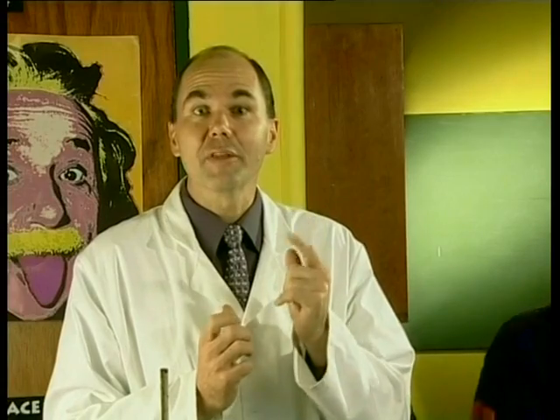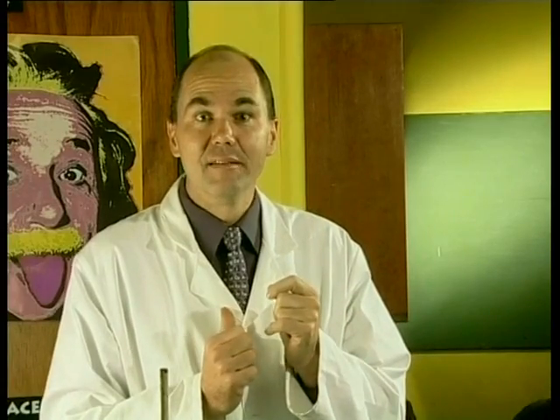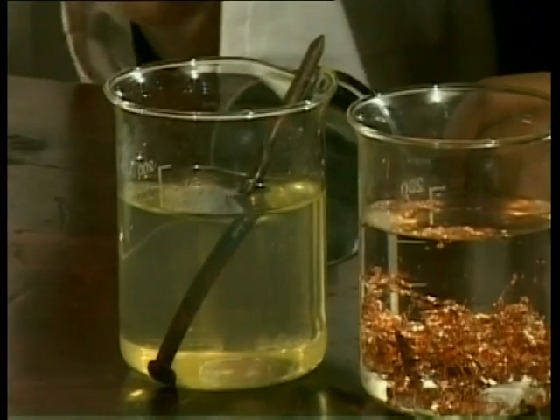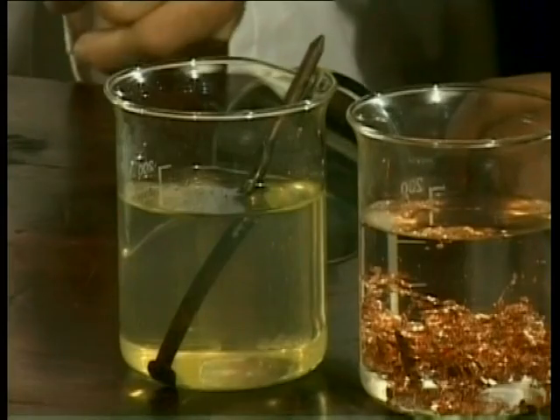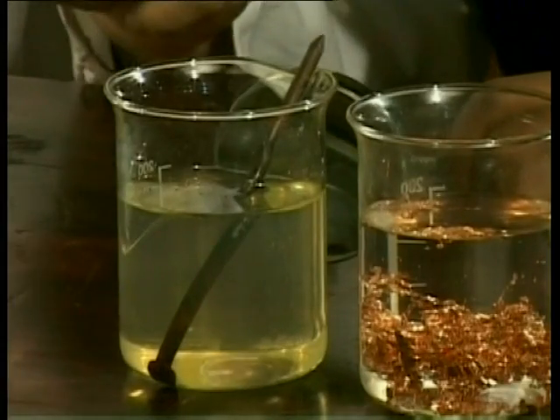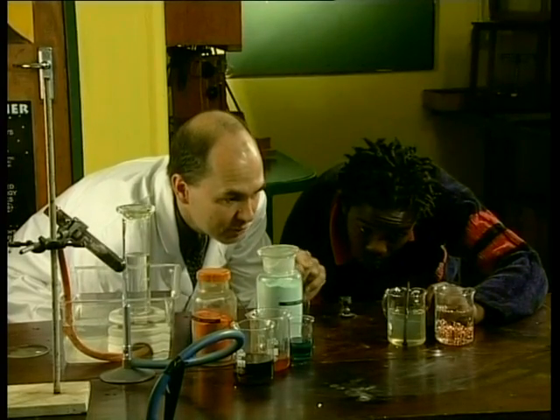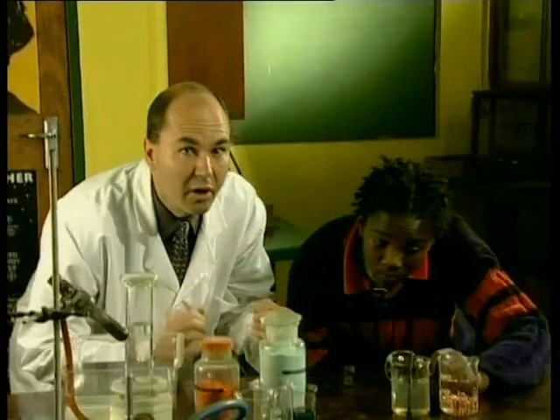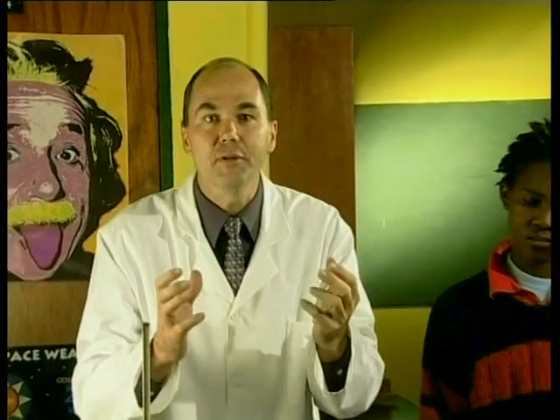But I think we'll notice something when we look at the iron nail. As you can see, there's an orange-brown coating on the head of the nail. This is called iron-3 oxide. So iron does react with water at room temperature.